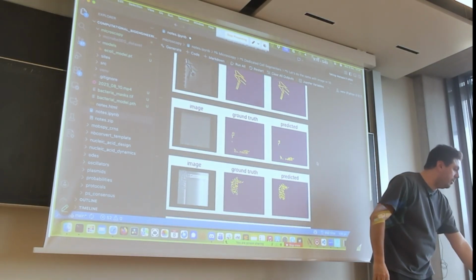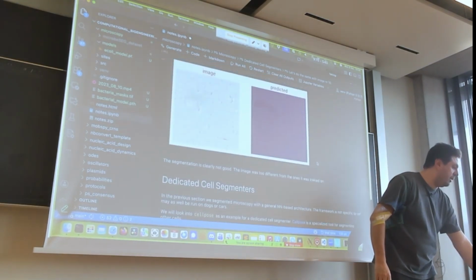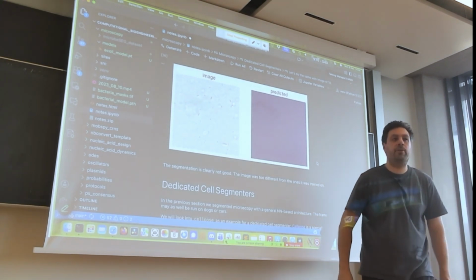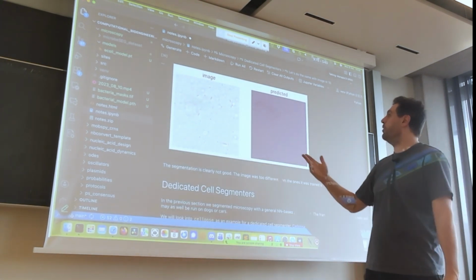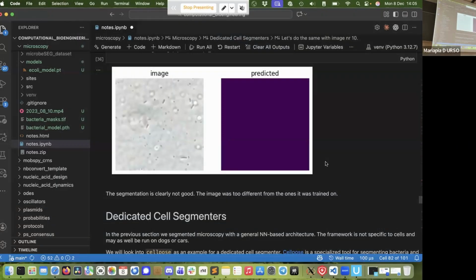And clearly it looks completely different from such images. And it just didn't generalize to that. Perhaps it's not very surprising, but I just want to show you that's kind of the limitation. We should not expect magic from this to happen, the generalizability.